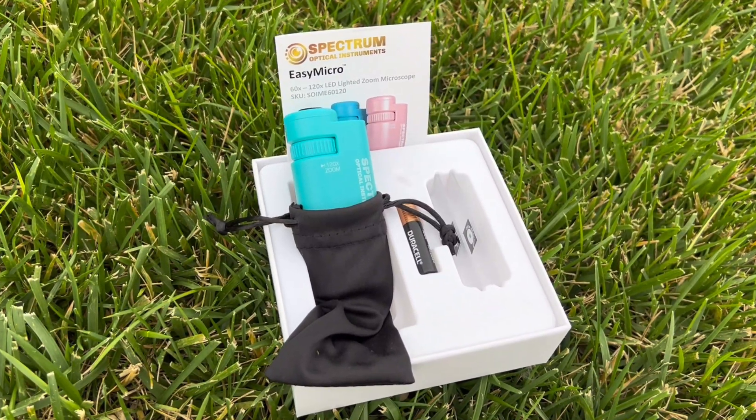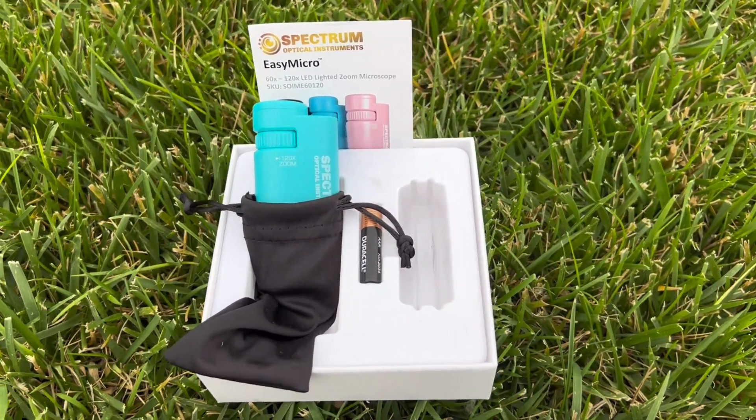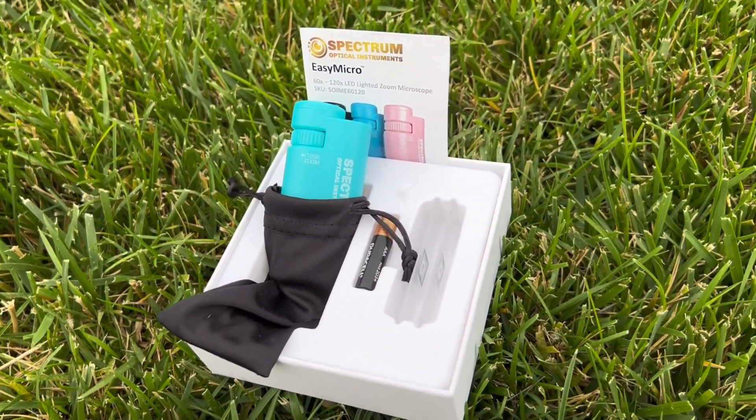This microscope kit includes the microscope body, a protective bag, two sample slices, and a AAA battery, making it an ideal gift for those eager to explore.